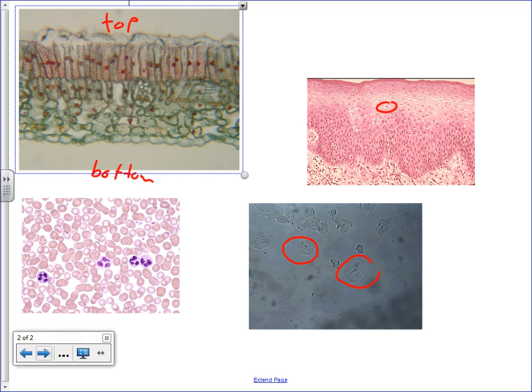They're not going to look much like what's in your cell diagram, but do your best to compare. If you think that this thing is a Golgi as opposed to a rough ER, that's your prerogative. Realistically, I'm not going to know one way or the other. I'm just going to look at your lab drawing and go, well, I can see how they might think that, and probably give you the marks. Now, if you draw a big circle in the middle and label it as ribosome, no, you're not going to get marks for that. It's the nucleus, silly.